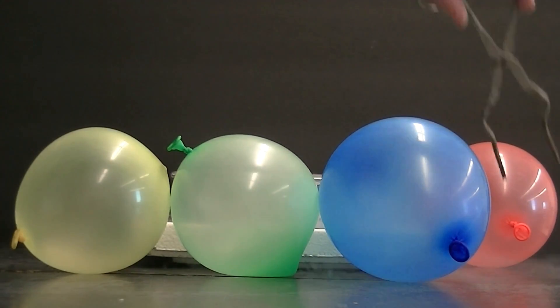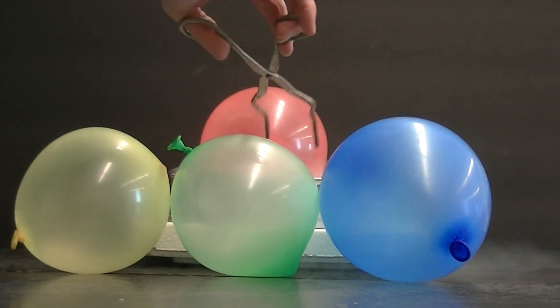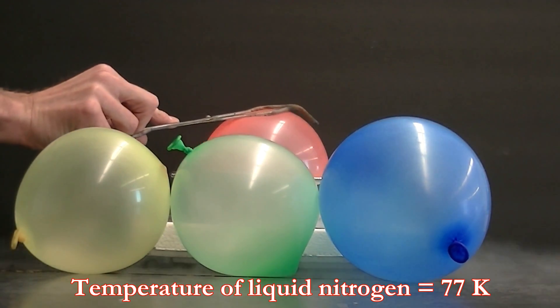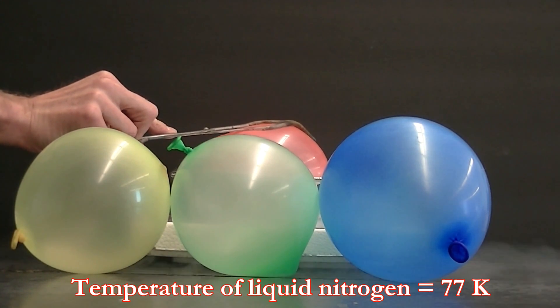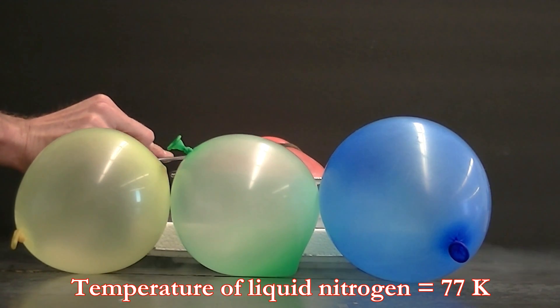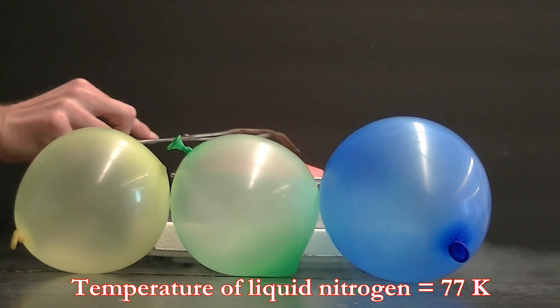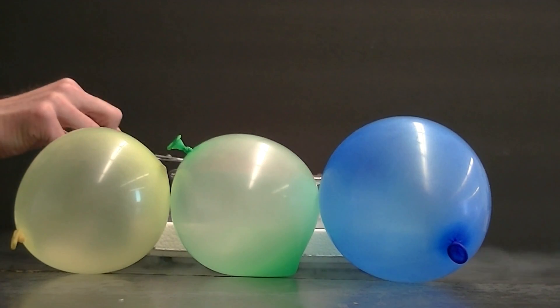I'm taking my balloons, take this orange one, place it in the liquid nitrogen. And as I place that orange balloon in the liquid nitrogen, as you'd expect, as the gas inside the balloon cools, the volume of the balloon shrinks.